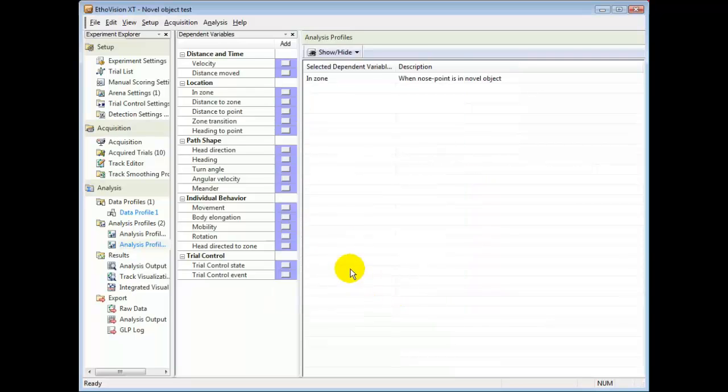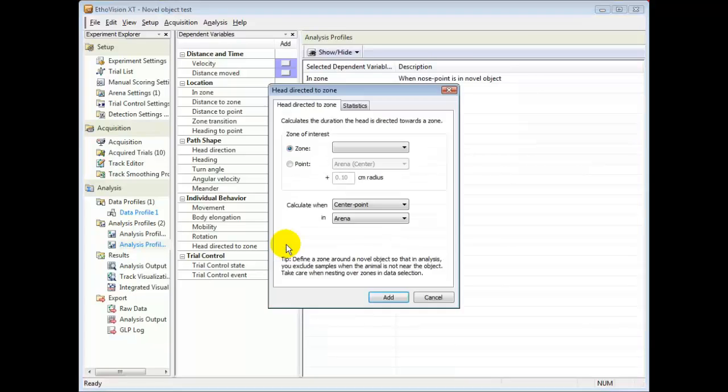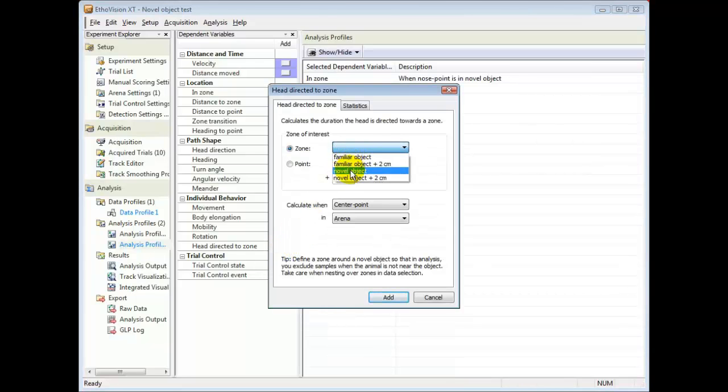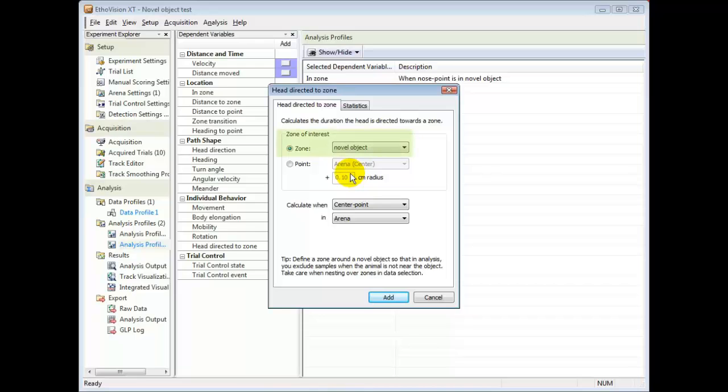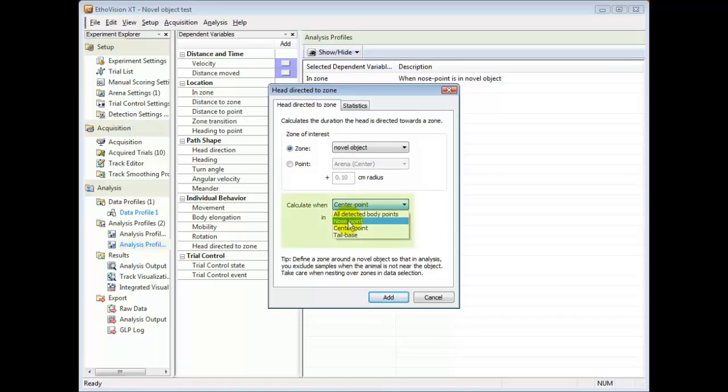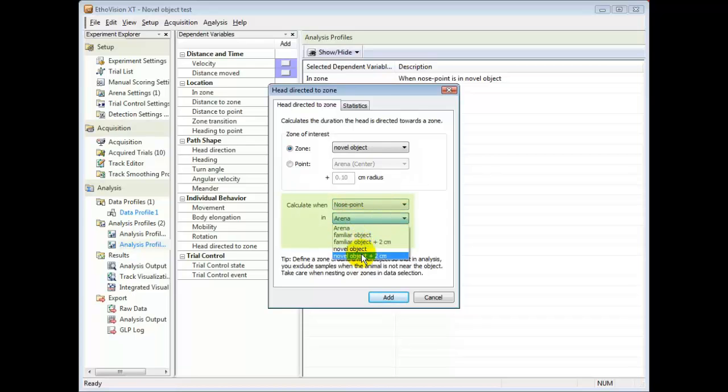I can also calculate this exploration more accurately. I can here calculate how often the head is pointing towards the novel object, but only for whilst the nose point is in the zone called novel object plus 2 cm.